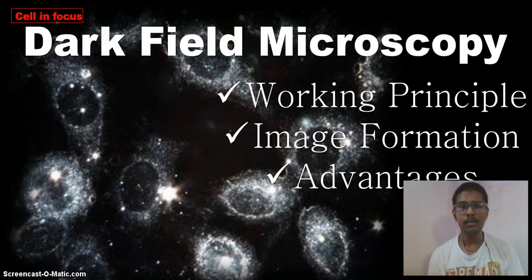That is the uniqueness. If you stain a cell, the function of the particular organelle you want to study can change. In that case you can't use staining, and dark field microscopy will be a great technique in that type of microscopic imaging experiment.